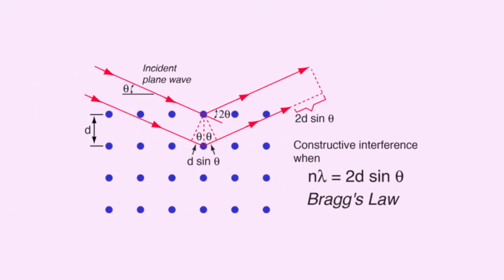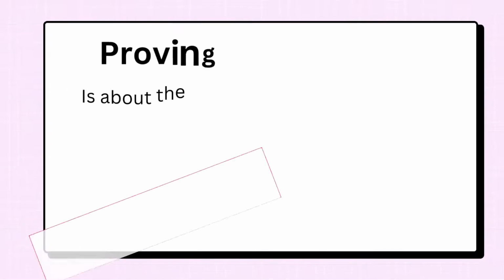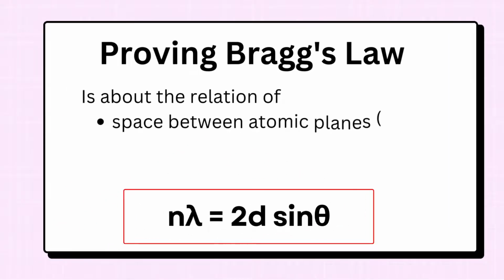Consider X-ray R as incident and RA as the diffracted beam from the molecules R, where the layers of the atoms are separated by distance d. Next, we are going to show how the Bragg's law equation has been proven.